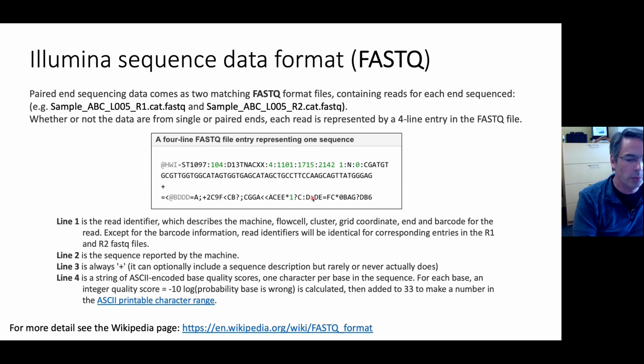Most programs, like the one we're going to use today, Trimmomatic, will recognize which scale the data is on automatically. Sometimes it guesses wrong, so it's good to know. Any old data, like the data we're working on today, is a little ambiguous. You couldn't make an assumption that it was on the new scale just because it was collected a while ago. But if you collect new data, you can assume it's on the new scale.